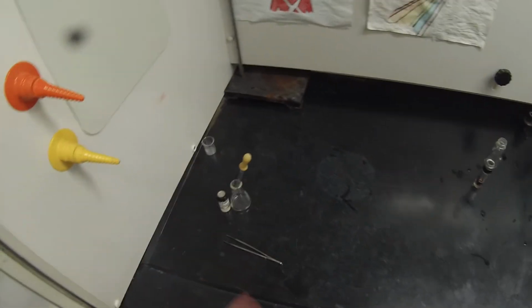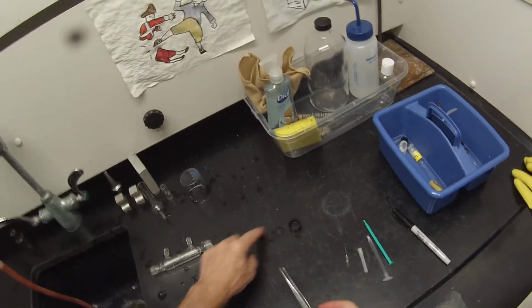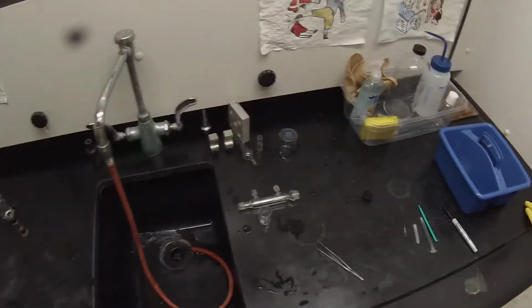So I've got my chloride sitting in there, and that's just going to sit there while I was off camera. One of the other things I was doing, in addition to cleaning up and monitoring the reaction, is I was starting up the gas chromatography mass spectrometer. That has to pump down for at least 24 hours to establish the vacuum in there, so we won't run that until tomorrow.